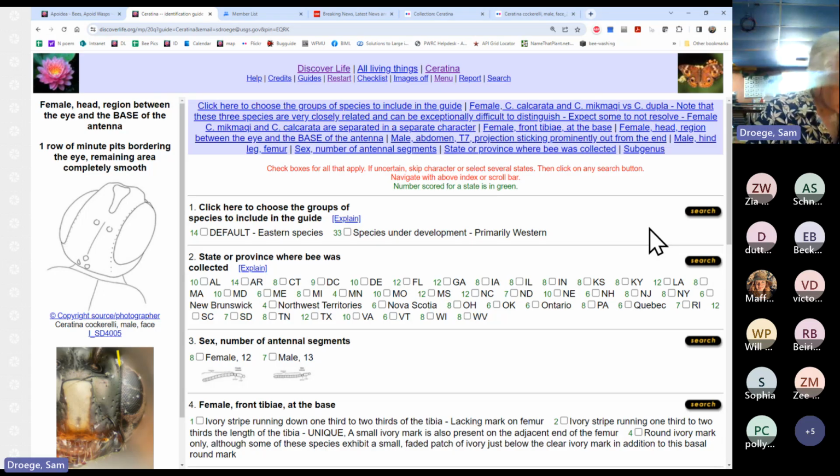Or maybe this one. Often I think they are the largest of the three, but there's a lot of overlap. Okay, this is good. I'm going to take the tag off again and put that into the scope.